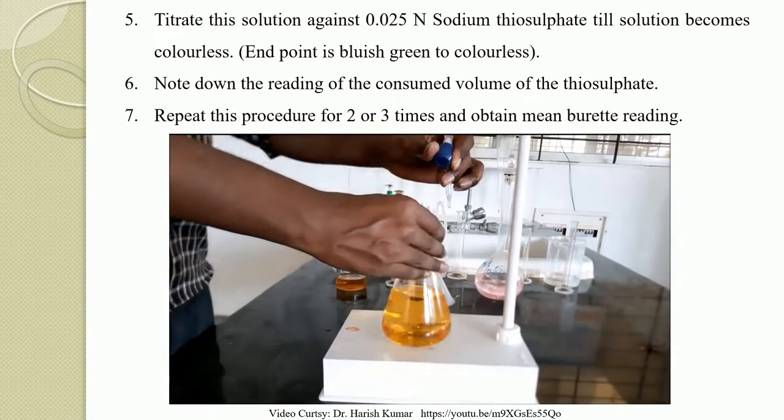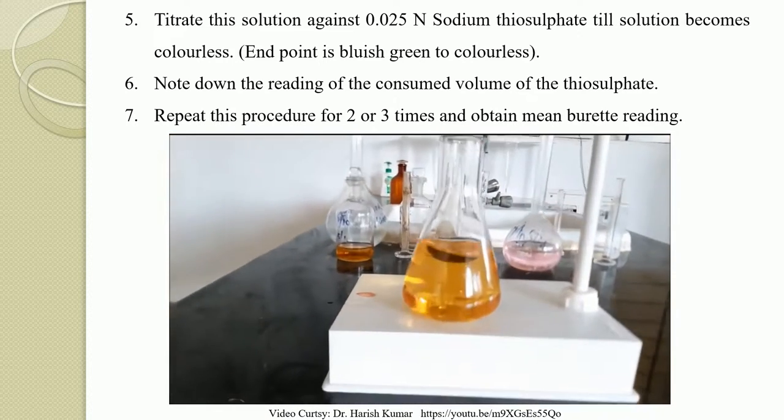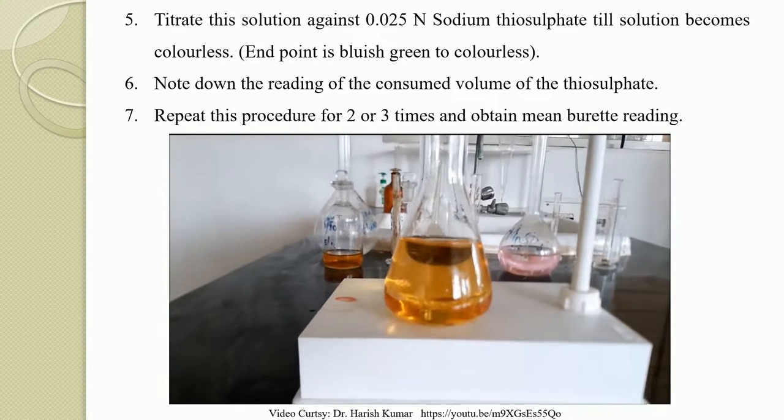As you can see, from the dark straw color, it has turned to pale straw color.